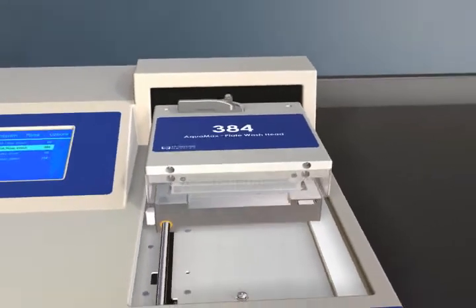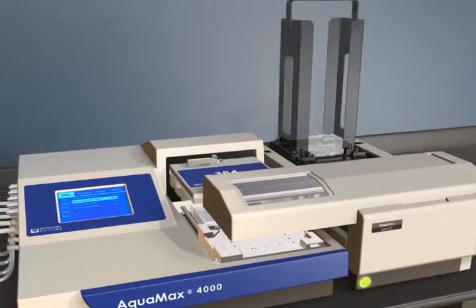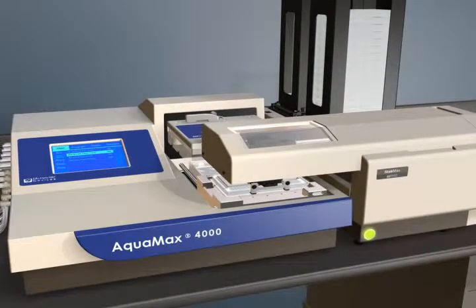The AquaMax washer system can be easily integrated to the StackMax plate handler or other automation platforms. No special programming or tools are required, and up to 50 plates can be run using the StackMax integration kit.